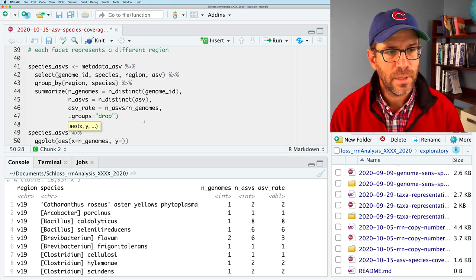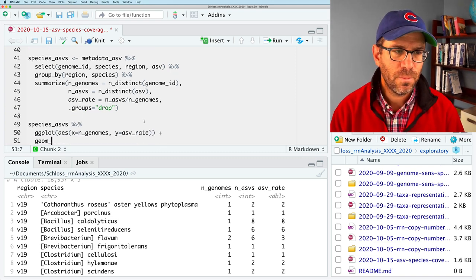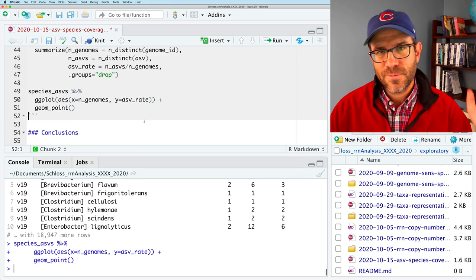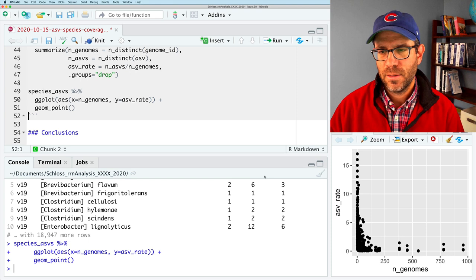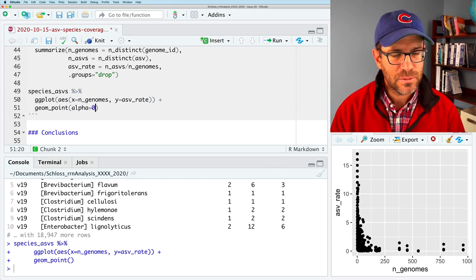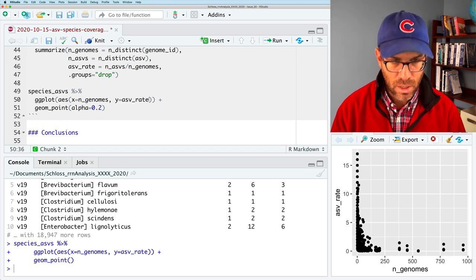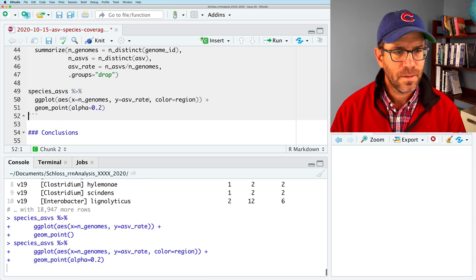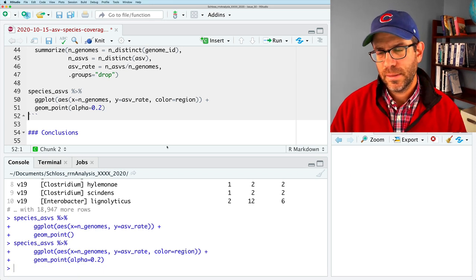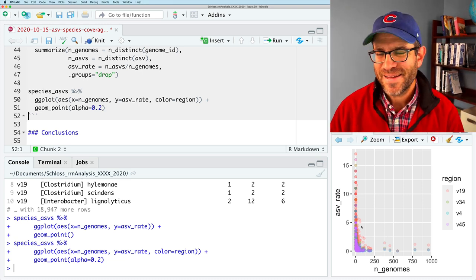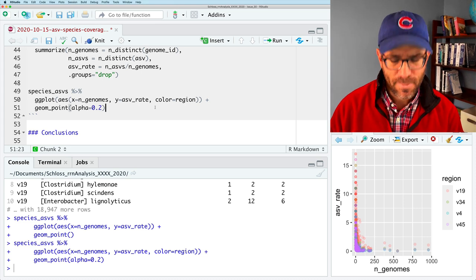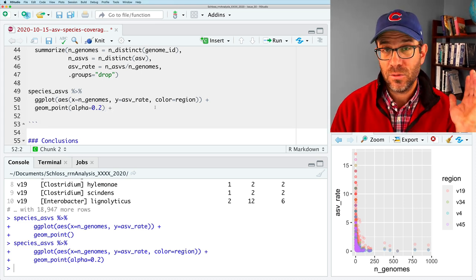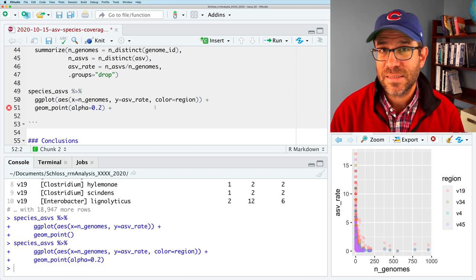And so we have our species ASVs. And we, again, see all the information we want. And we can then say species ASVs. And we're going to pipe that into ggplot AES for aesthetic. It's going to be a dot plot. So on the x-axis, we're going to put the number of genomes, so n genomes. On the y, we're going to put the ASV rate. And then we will do geom point. And this will throw everything together, which isn't exactly what we want.